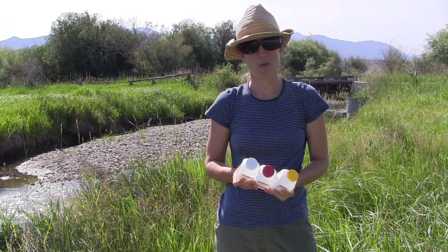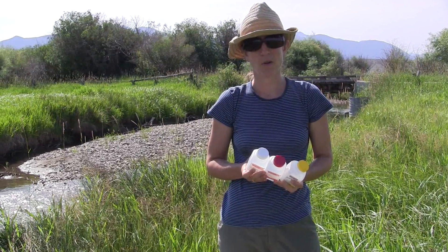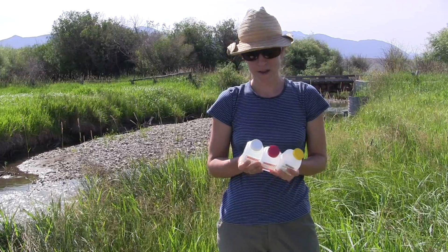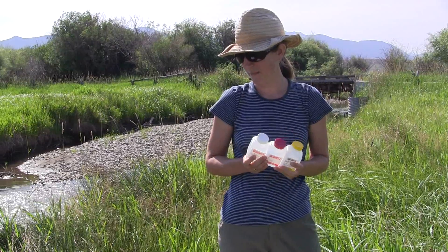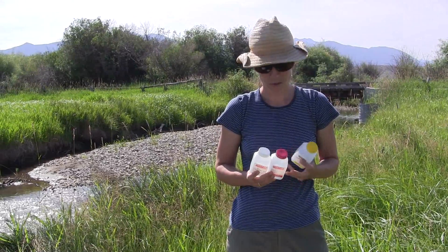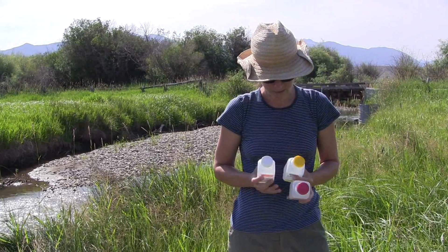In this video we are going to go through the process of filling lab sample bottles for the Madison stream team. Depending on the site you're visiting, you'll have either two or three different types of bottles to fill.